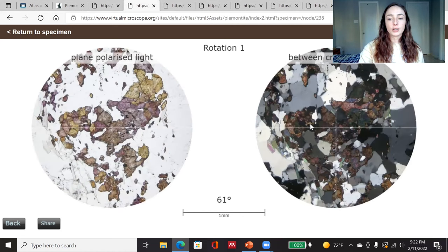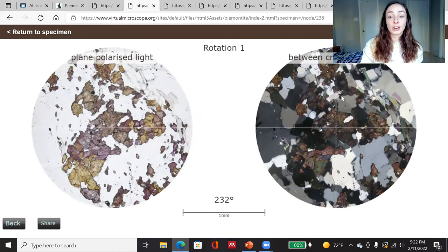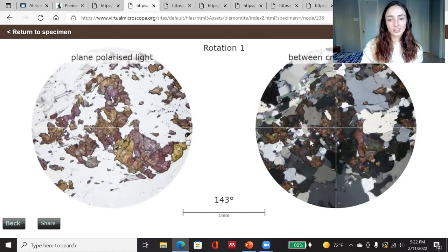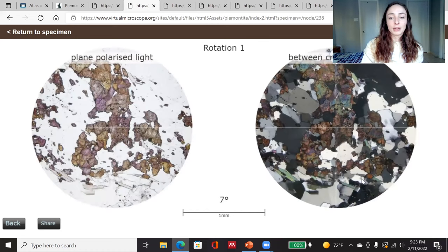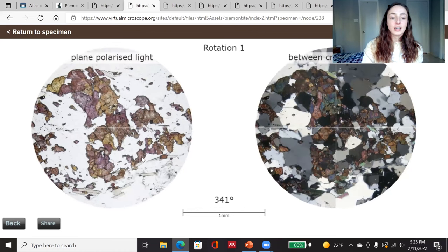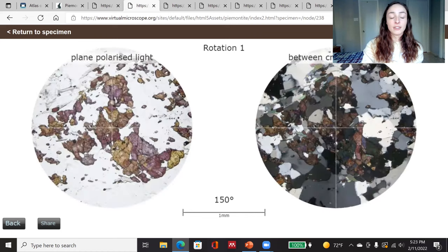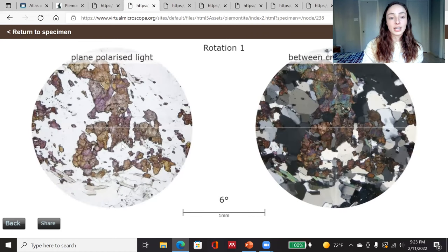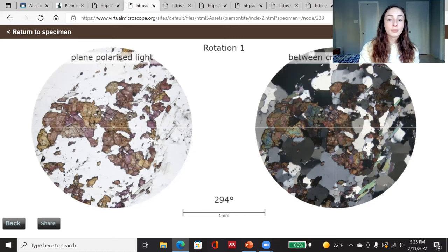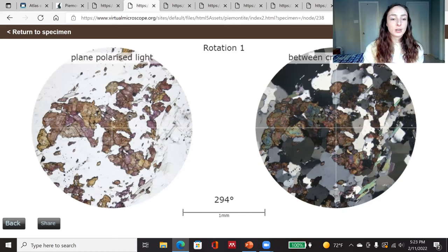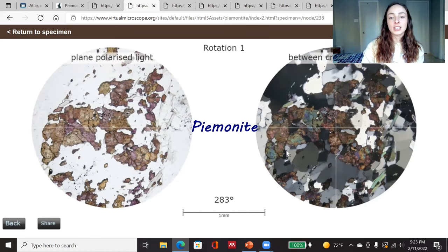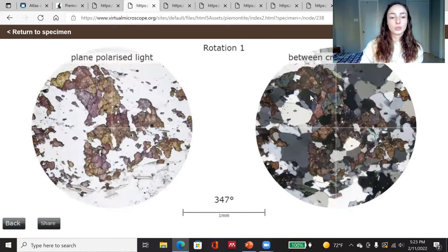The other quartzite sample I want to show is not pure quartz, and I wanted to show it for that reason. It also has smaller quartz grains. You can see as we rotate the cross-polarized image that the quartz is very flashy black and white — classic quartz under cross-polarized light. In plain polarized light you can hardly see the quartz at all because it doesn't have pleochroism. However, there is an accessory mineral in this quartzite that does show pleochroism — a pinkish-orange color in plane-polarized light and a greenish-bluish-brownish color under cross-polarized light. This mineral is piemontite.